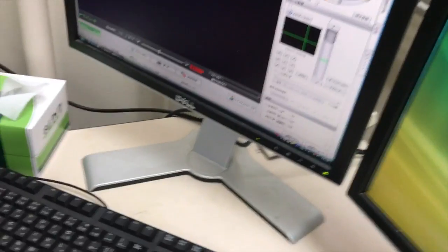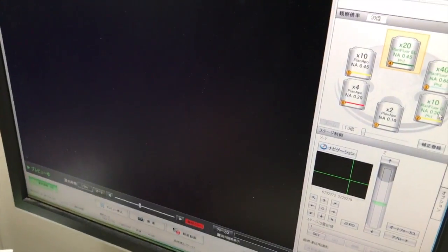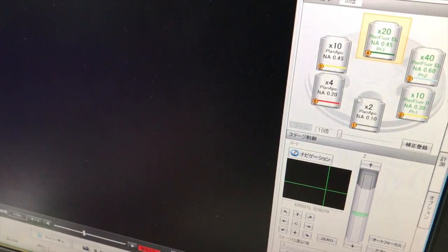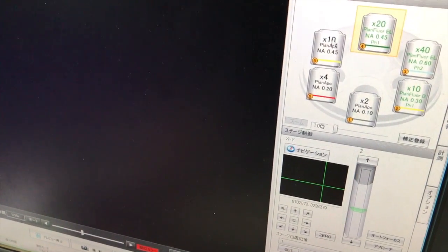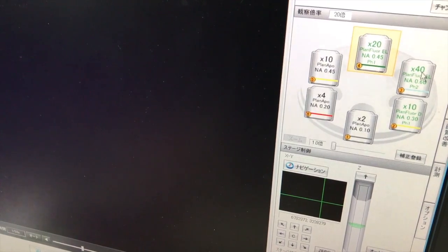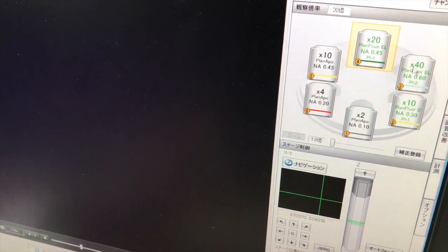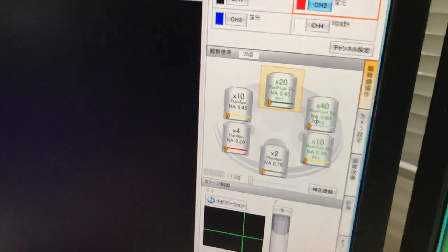So in here, so these three lenses, if you want to use the fluorescence, you have to use this. In normal, you can use this one, but this one in magnification is up to 10 times. Here you can find one. So you can use this one for normal, yes, for both. No, for both.